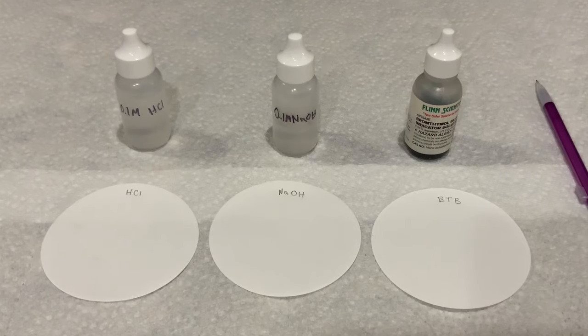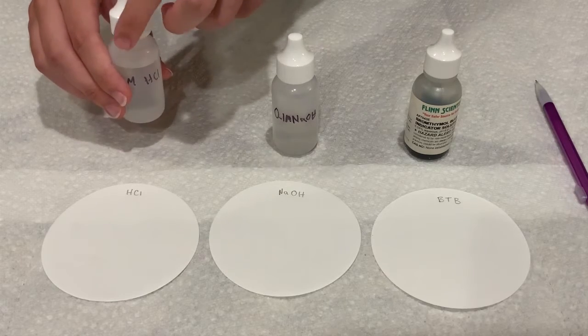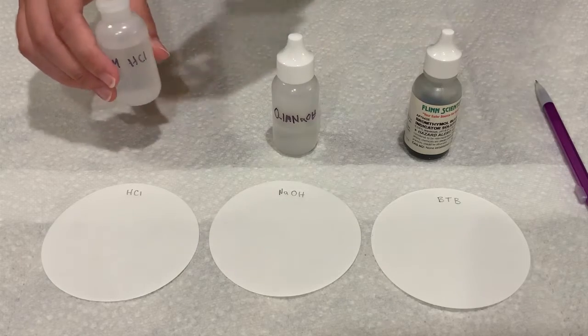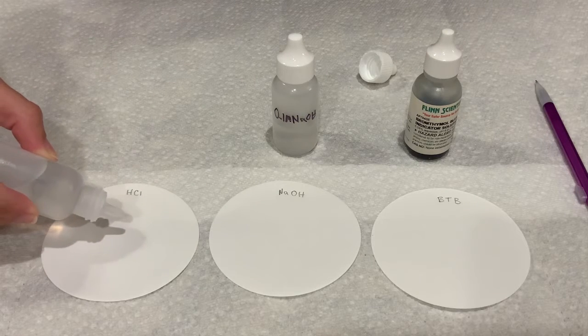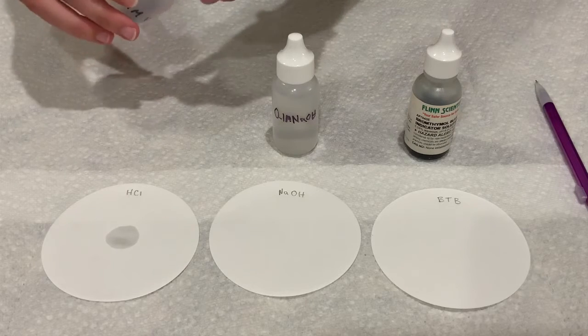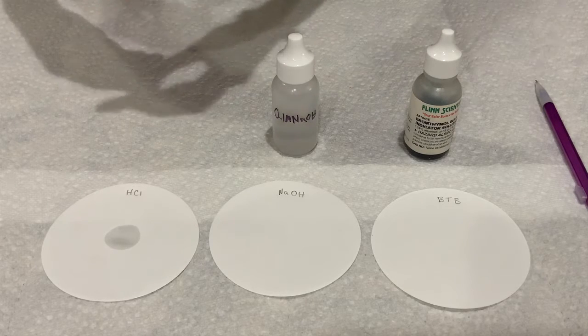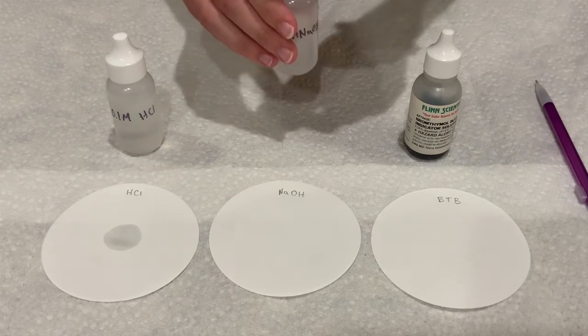So let's roll. Okay, so what we have here are three pieces of filter paper labeled HCl, NaOH, and BTB, and we're going to put a drop of each of these solutions on each piece of filter paper. The first part of the experiment is to measure how far the solution wicks out onto the filter paper. These are 0.1 molar solutions of the sodium hydroxide and the HCl.